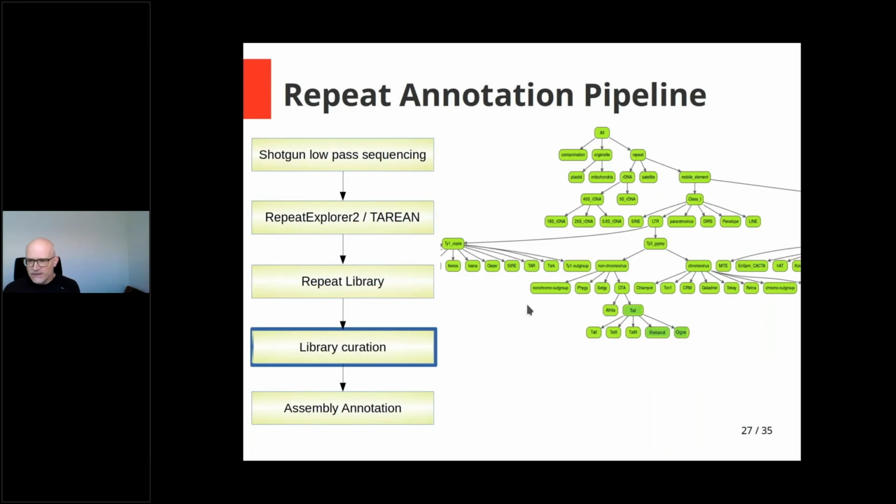And all these clusters are annotated, and what we really highly recommend is that you do some manual curation of your results, because you cannot take the annotation for granted. There are a lot of exceptions in biology, so it's always good to explore these annotations critically. And again, it's a part of the tutorials on the RepeatExplorer YouTube channel, so you can watch these.